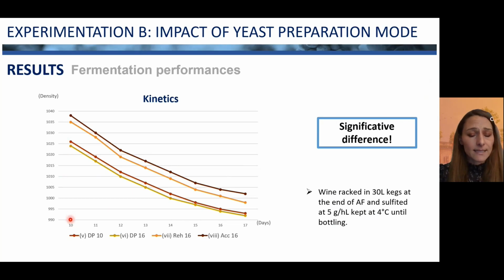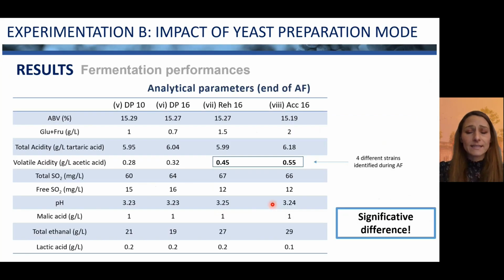We start here at day 10, and we're ahead of the 2 scenarios with rehydration and acclimatization, and ended at 17 days, when the 2 other scenarios took 4 more days to finish. So we see significant difference on the kinetics. On the analytical parameters here, we also see some differences.